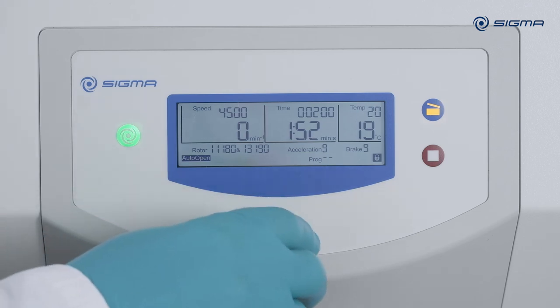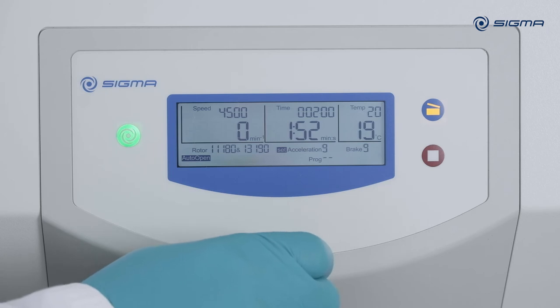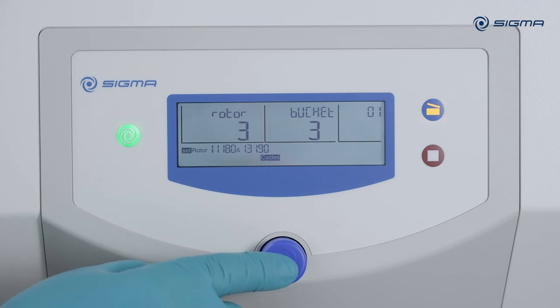Every rotor can only be used for a defined number of runs. You can view the number of completed rotor runs at the bottom of the menu. The centrifuge automatically displays an error code when the maximum number of runs is reached.